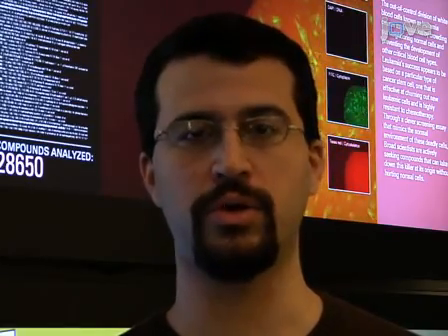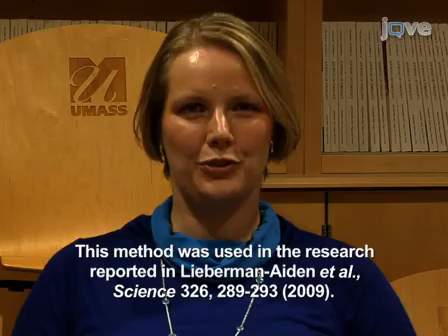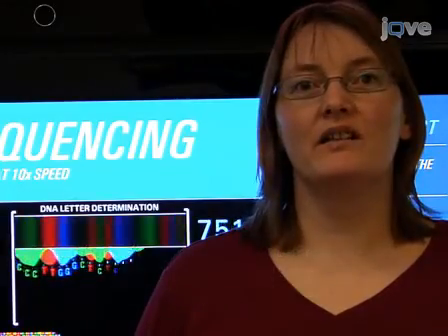Today we will show you a procedure for genome-wide chromosome conformation capture called Hi-C. We use this procedure in our laboratory to experimentally explore the architecture of the human genome. The first part of the procedure we'll show you will take place at UMass Medical School, and the second part will be done at the Broad Institute. We'll also show you how we've used the results of the Hi-C experiment to simulate the dynamics of the genome at MIT. So let's get started.